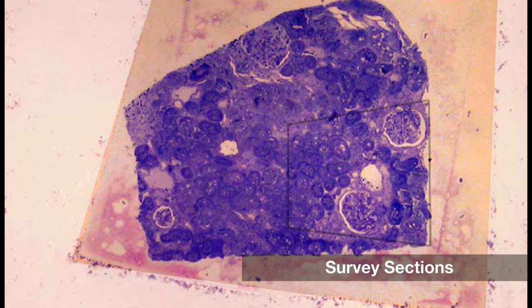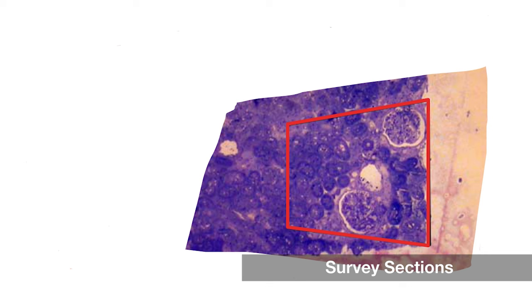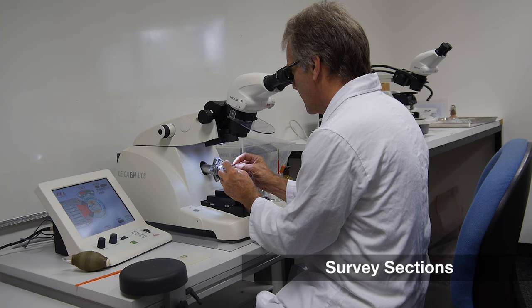Survey sections are too large and too thick to use in the electron microscope. Hence the block is re-trimmed to reduce the area of the cutting face. The re-trimmed block is returned to the ultramicrotome and realigned.